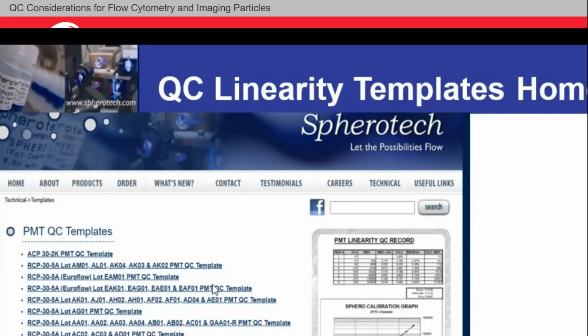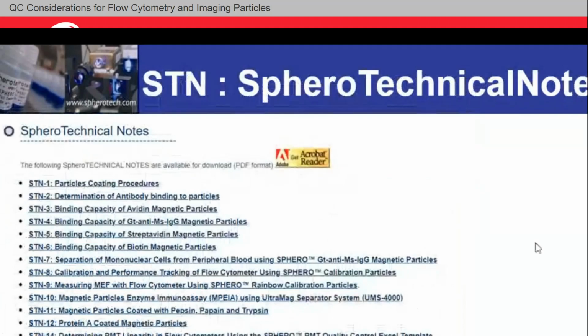You'll get a technical data sheet with your particles. On the second or third page, you'll see MEF values. Those MEF values should match. Another way that you'll be able to tell is through the linearity, through the actual calibration tool, the template, your instrument. So these are some Spherotech technical notes.